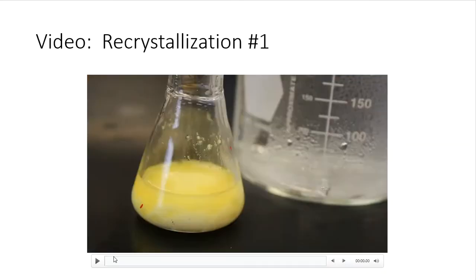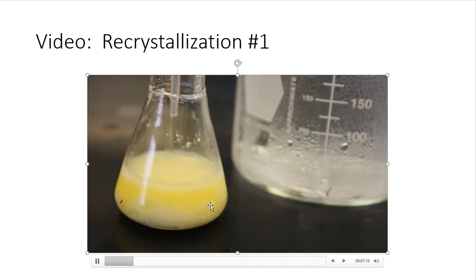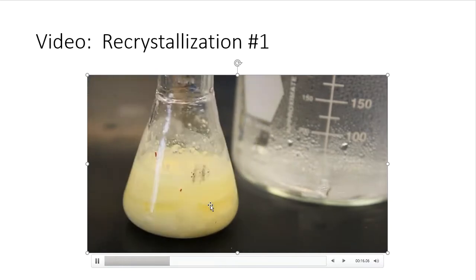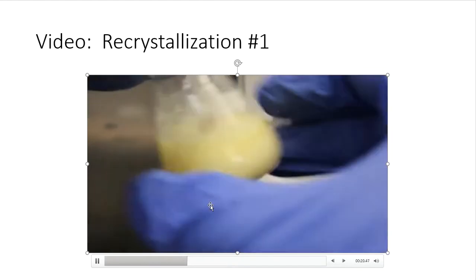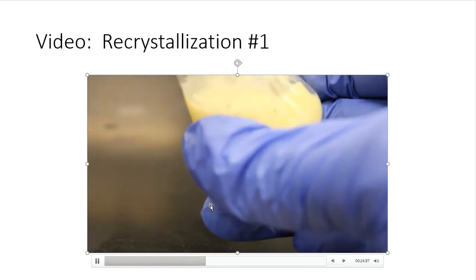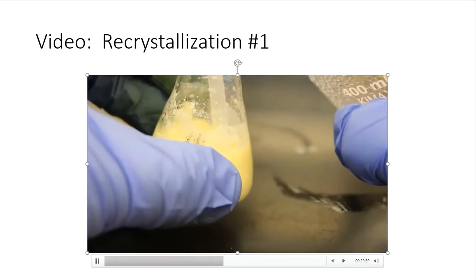All right, so here is recrystallization step number 1. As you can tell, it's already starting to get cloudy again, right? I see that just by taking it off the heat and taking a picture of it and getting my camera set up, it was already coming out. So I'm going to add some cold water, and that forces those crystals back out of solution. And now you can see that there's tons of crystal on the inside. That's what we're after. That is the definition of recrystallization.